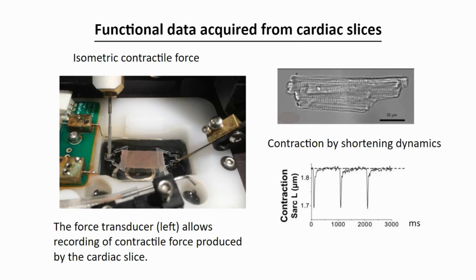Many of you in the audience, I'm sure, are familiar with measuring contraction of the isolated cardiac myocyte. In that case, the shortening and re-lengthening of sarcomere length is recorded as a measure of contraction-relaxation function. And often the maximum contraction, or the shortest sarcomere length, is used as a measure of contractility.